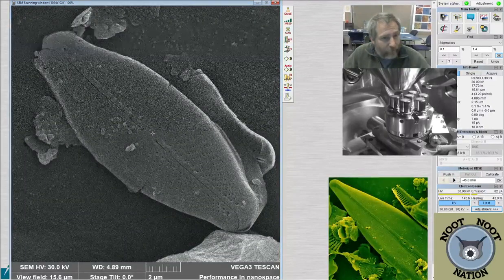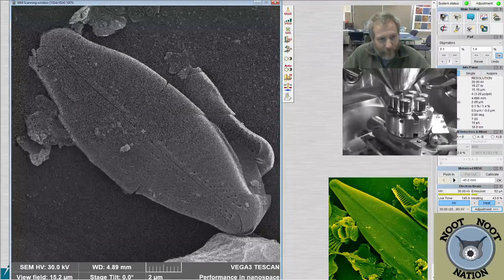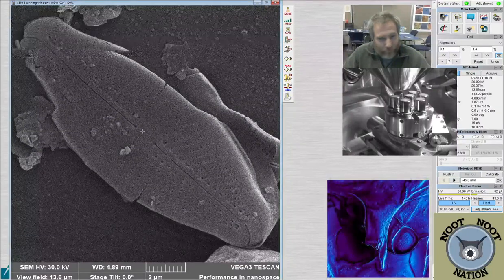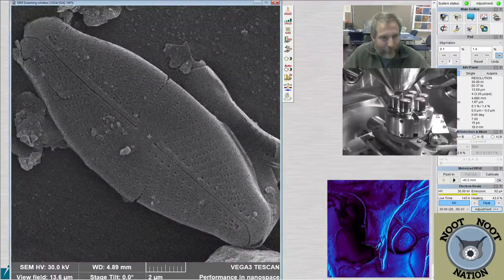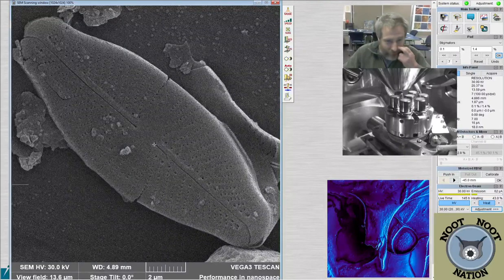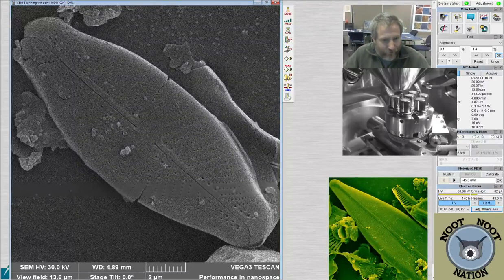But Anna usually makes fun of me when I say Sellaphora, because it's a good place to dump a lot of things when I don't know what it is. I usually go, I don't know, Sellaphora? Because it has a lot of limited characteristics that show up regularly. So, actually, I'm pretty sure this is Sellaphora.